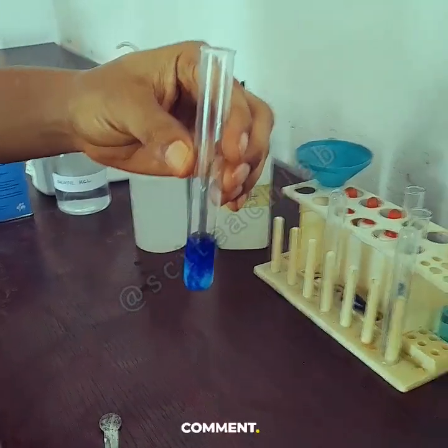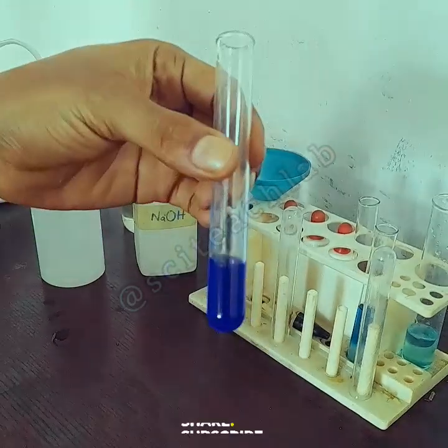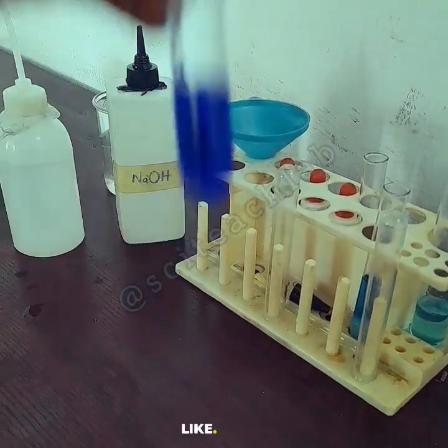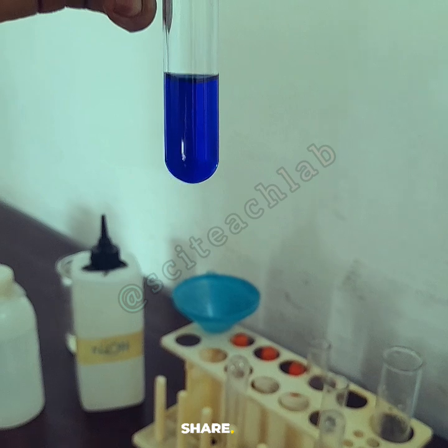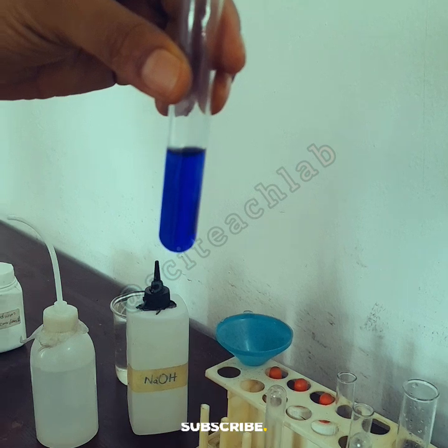So I add my ammonia in excess, and it just looks like it's dissolving, but let's see. It dissolves. Okay, I didn't even have to shake too much, and you see a clear liquid. So that precipitate dissolves completely and forms a deep blue solution.